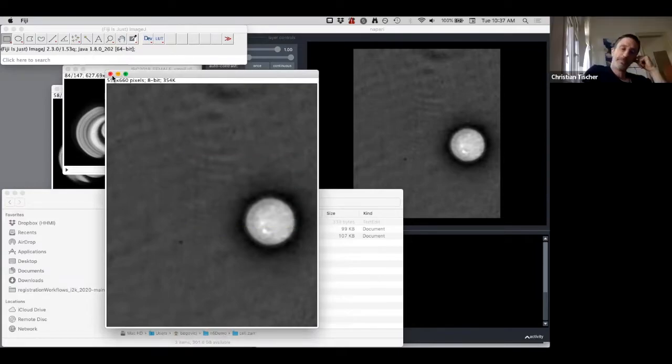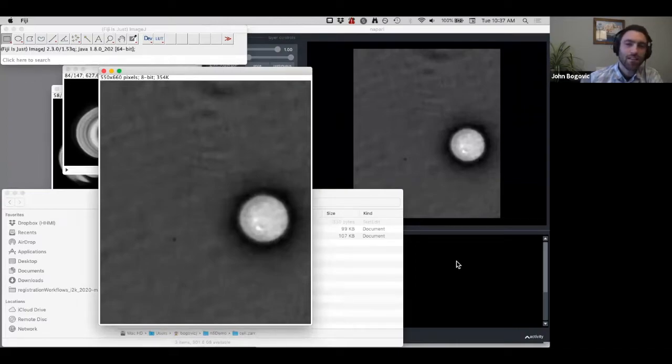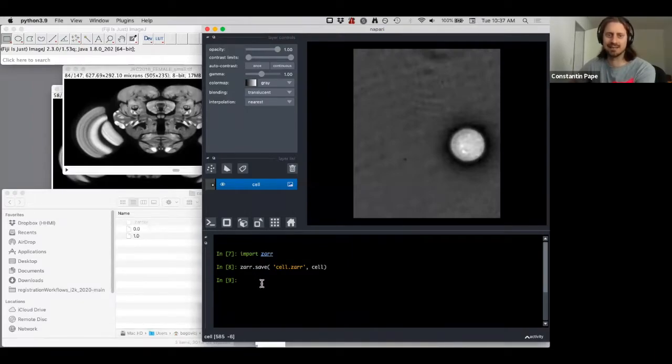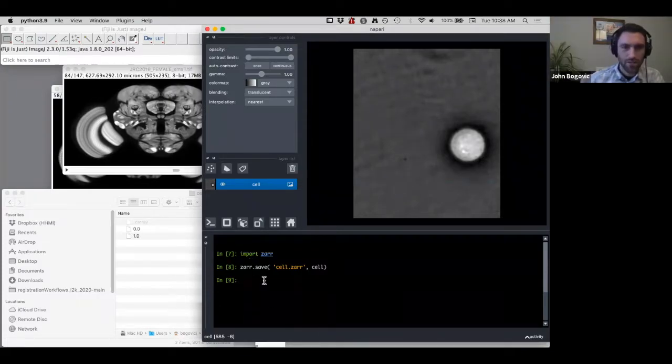Okay. John, yes. Is there some way of doing this with metadata or not? Not cleanly. At least I don't know of a way; we'd have to write the Python code. Exactly. The clean way, if you want to write the NGFF metadata, is to use OME-Zarr instead. It doesn't have such a clean API yet as pure Zarr, but it's getting there. Okay. So maybe we can get a link to that in the chat too. That would be great. Thanks.